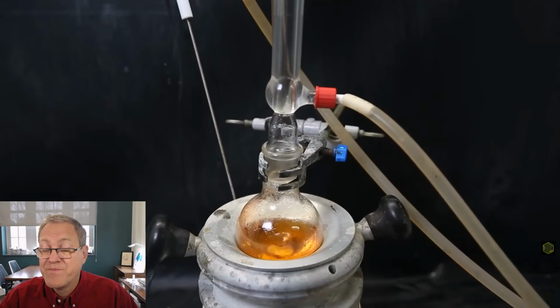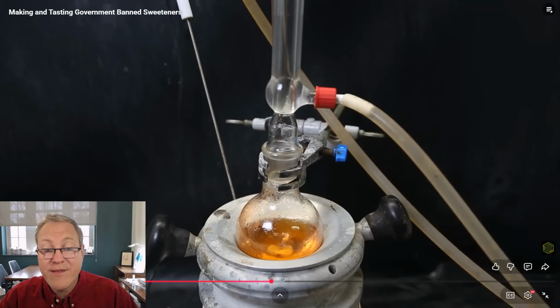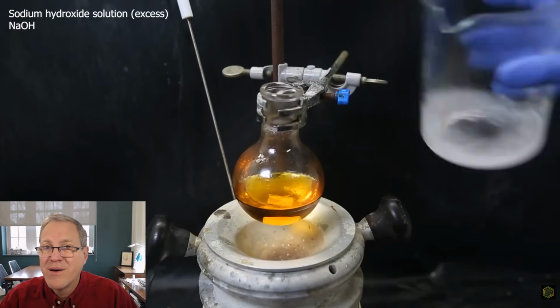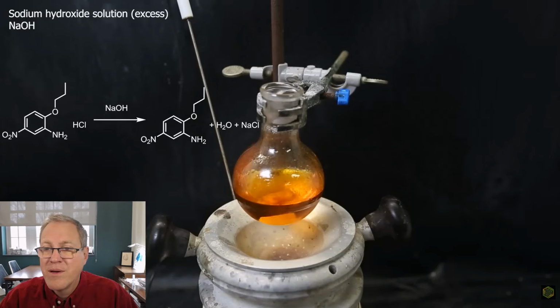When I come back the next day, everything has dissolved, and it has become orange, which is a good sign, so it should be finished. It is orange. And he wants his product to be orange, so that's a good thing. I then take it off heat and add an excess of a sodium hydroxide solution with a random concentration to neutralize all the acid and return the amine to its free base. I also add some ice to cool it down.